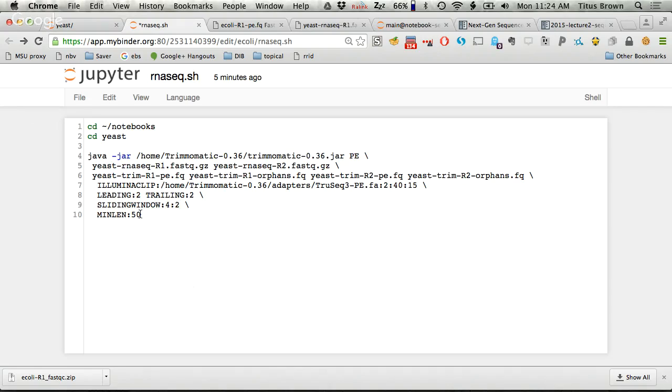Changing things semi-randomly in bioinformatics is a really big problem because you never know, like, did I change the quality trimming parameters for the 3rd batch of RNA-seq, or did I remember to do it for all of them? And at the end of the day, that kind of uncertainty is not, you know, which pH buffer did I use for that? Like you've all been there, right? So just be boring is what I'm saying. Okay, so this is now the command we're going to run. And I'm going to save this.